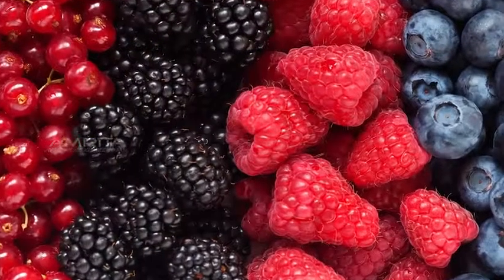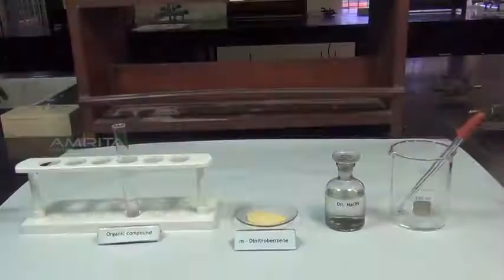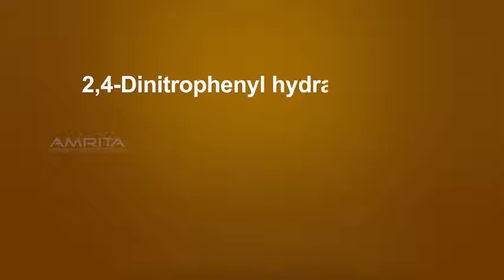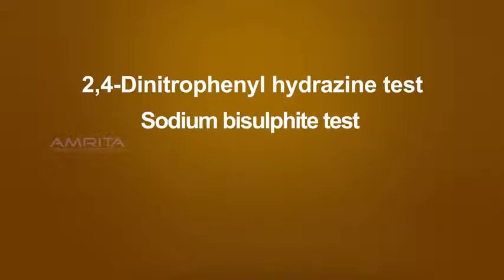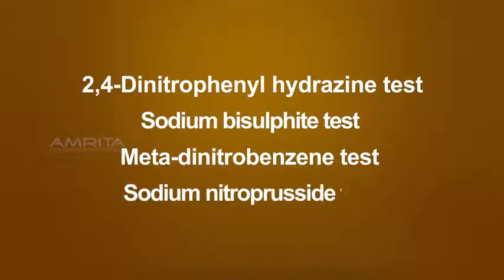The flavors of berries and mushrooms are due to the presence of ketones. Our aim here is to identify ketones using some simple tests. They are 2,4-dinitrophenylhydrazine test, sodium bisulfite test, meta-dinitrobenzene test, sodium nitroprusside test.